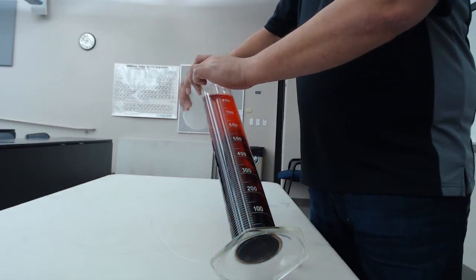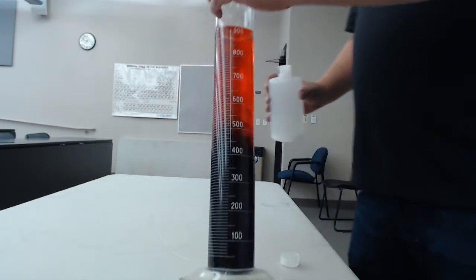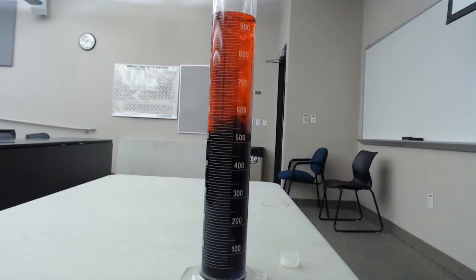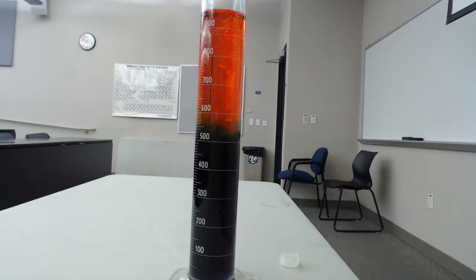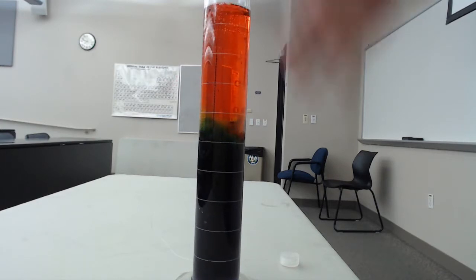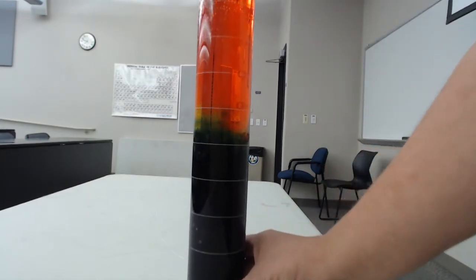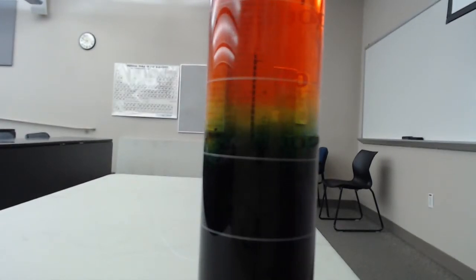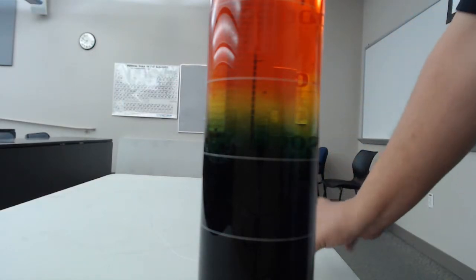See any color changes? Yep, a saturated solution is more dense than the acid solution, so it should just fall to the bottom. And what ends up happening here is we get some cool colors happening mostly in the middle right here. What kind of colors do you see in there? See all kinds of colors there?